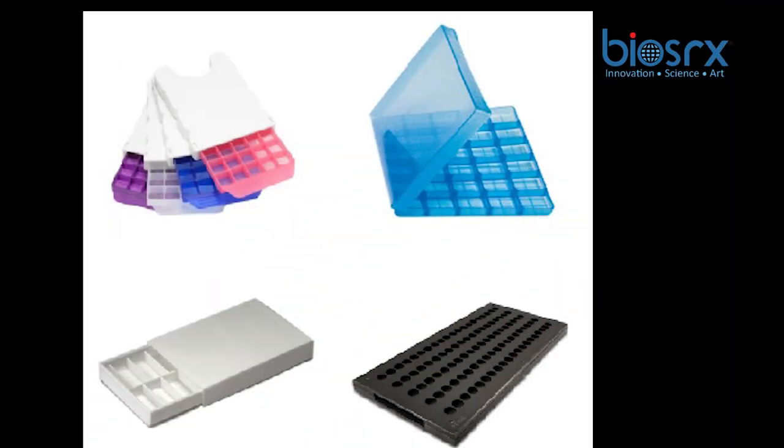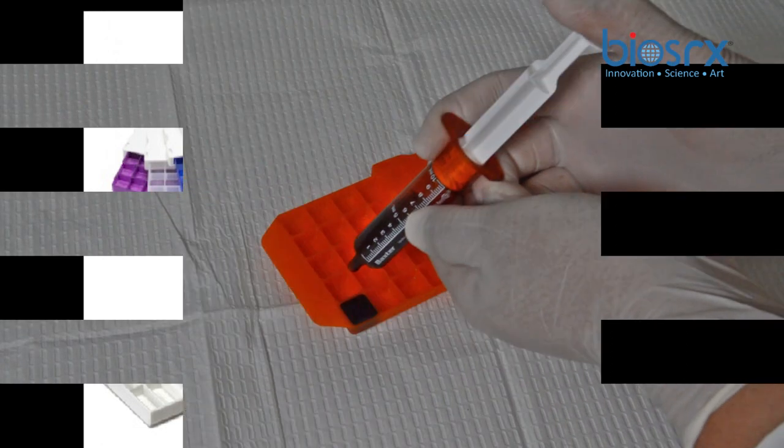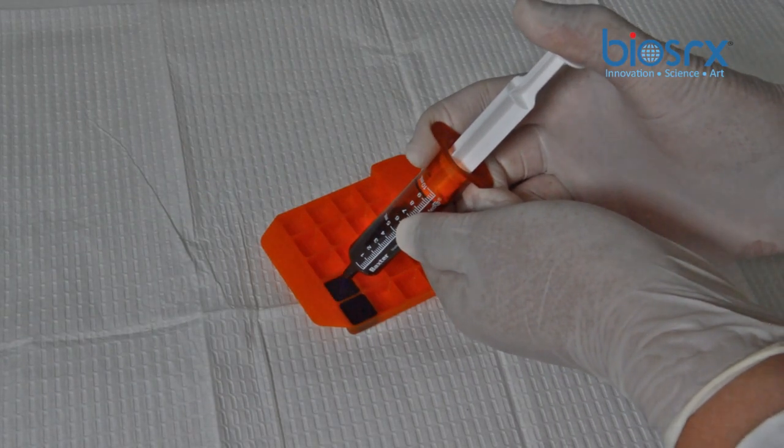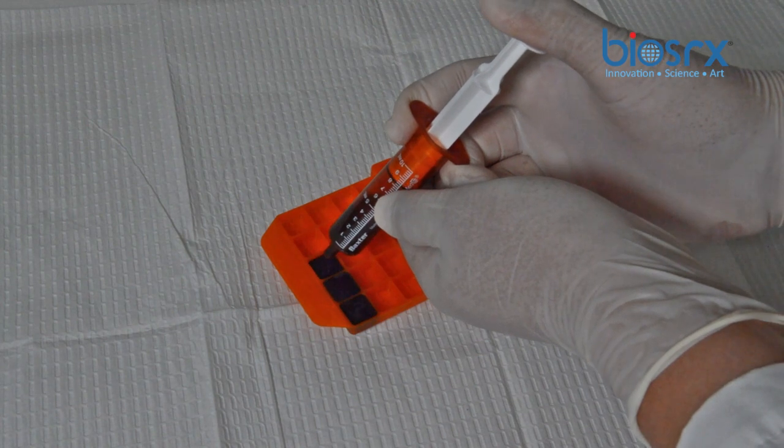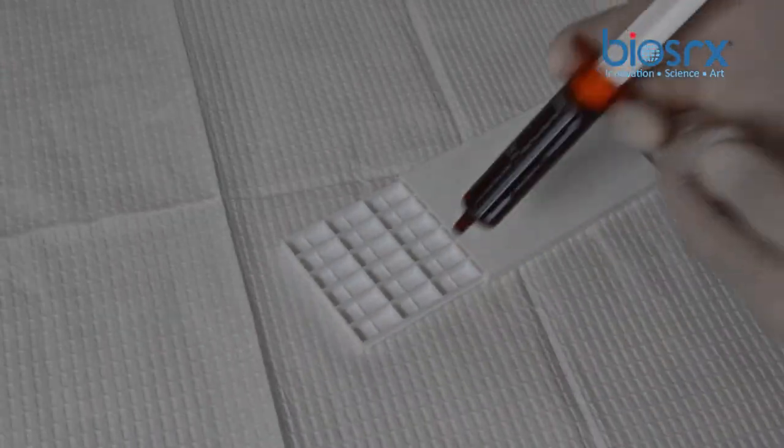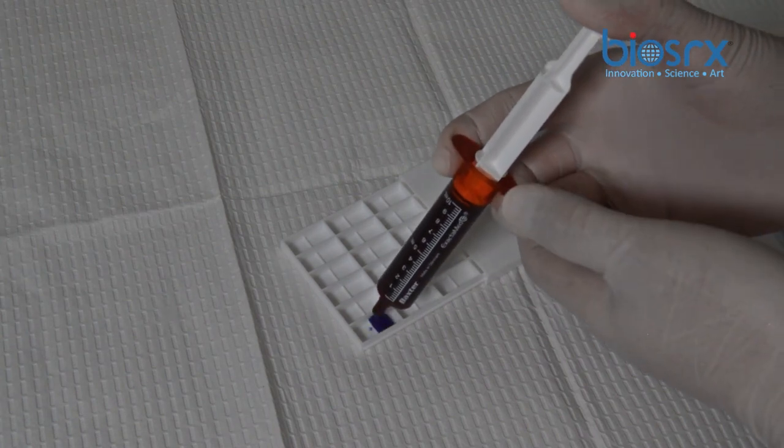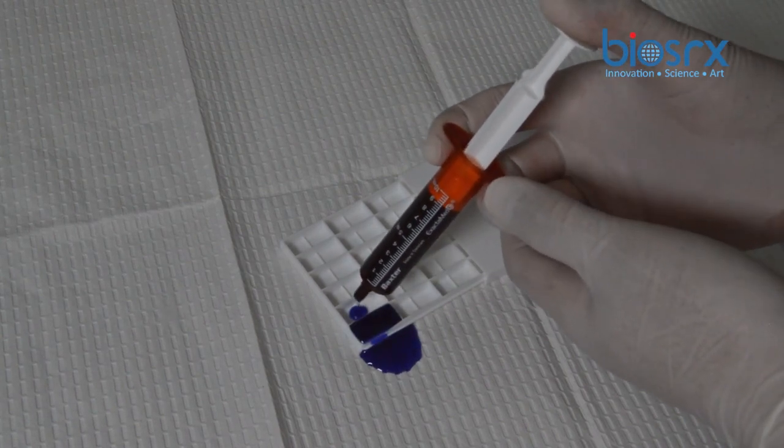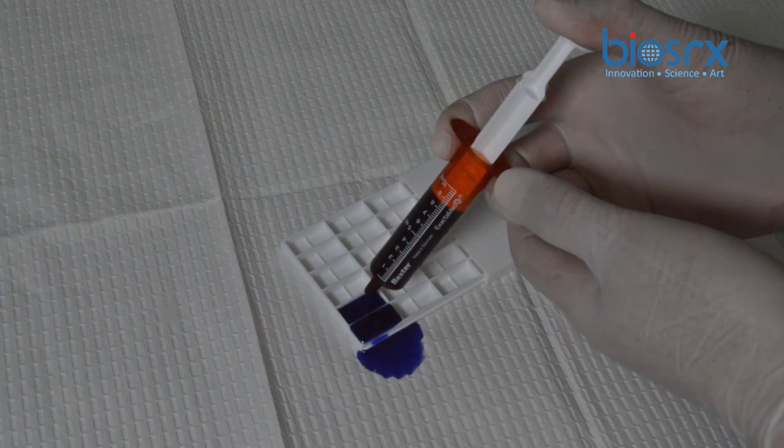When we compare the RD trochee molds to their competitors, their competitors must be syringe-filled one by one, making it more time-consuming. Because this method takes a long time, the integrity of the medication may be altered due to temperature changes of the base as it cools down. Furthermore, accuracy of dose may vary due to human error.